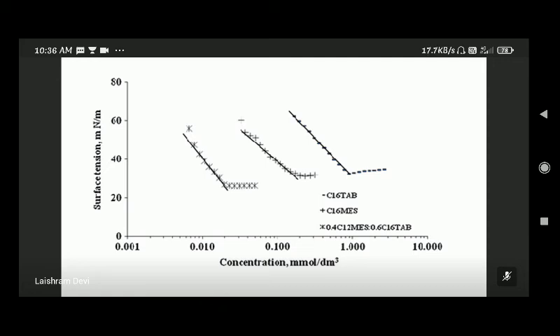So now finally you will see how the surface tension varies with the concentration of detergent. For that you will plot a graph. On the x-axis you will take concentration, whatever concentration of detergent solution is given, maybe in terms of percentage or molar, write the corresponding unit on the x-axis. On the y-axis, surface tension; whatever unit is given for the surface tension of water, you'll have to write in the same unit. Then you will see how the graph looks.